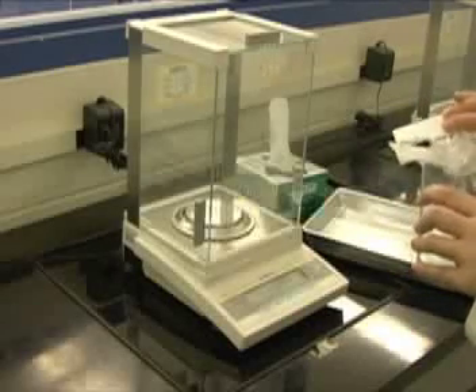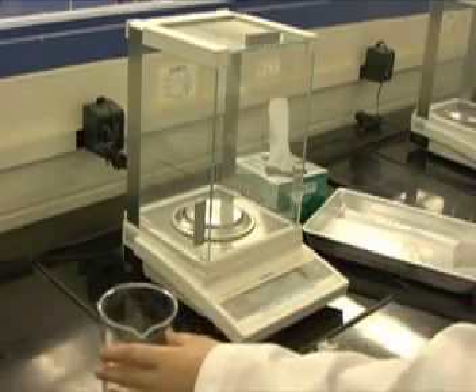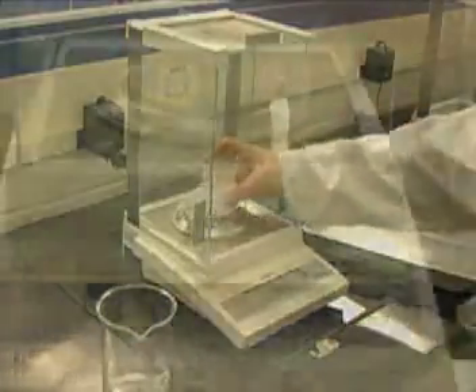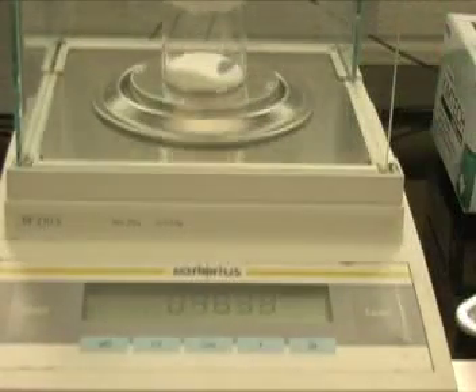Be careful not to spill any of the sample. If the sample is spilled, the amount in the beaker can no longer be used and you must start over your weighing by difference procedure with a new clean beaker.